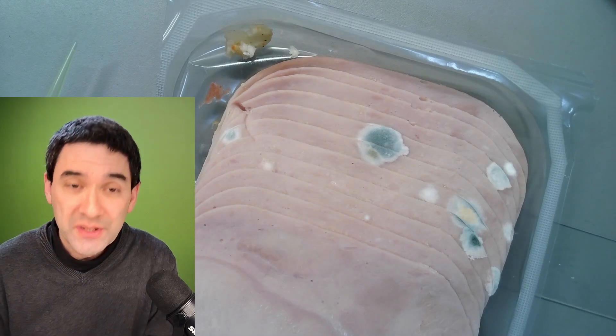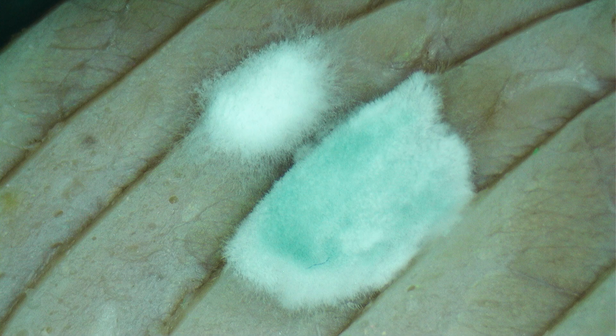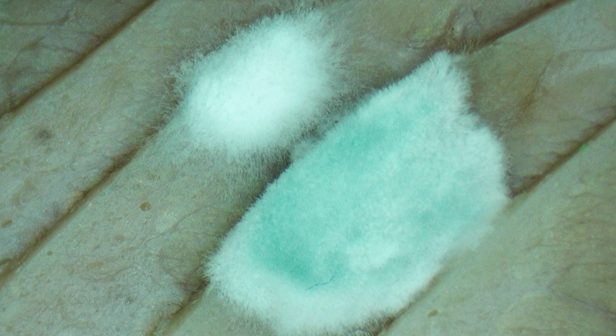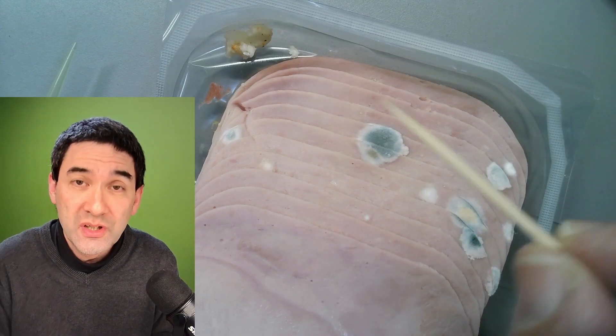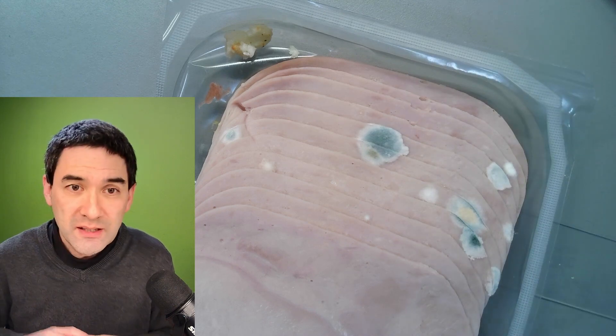I'm going to carefully take a small sample here. Eating this stuff is of course going to probably make you very, very ill. So I also want to be careful because there are lots of bacteria growing on the surface here, so I don't want to touch it. I'm therefore going to use disposable toothpicks to take a sample. Let's get started.